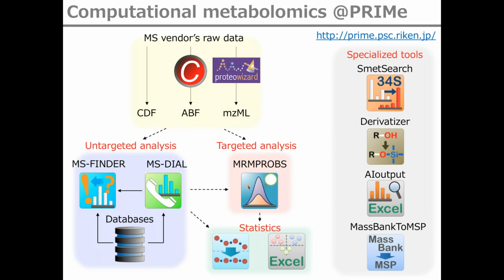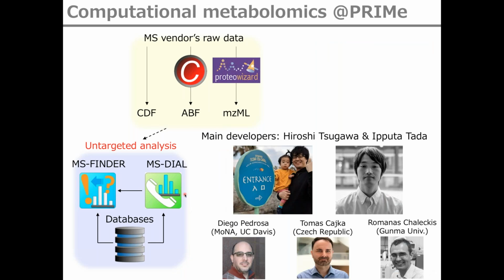And finally, there are several programs to perform, for example, data normalization and multivariate analysis. Recently, these programs have been integrated into the MS-DIAL program. There are also several specialized tools developed for specific study cases. But I think MS-DIAL is the biggest program, and there are many users of it. Therefore, I would like to introduce the main collaborators for MS-DIAL development.